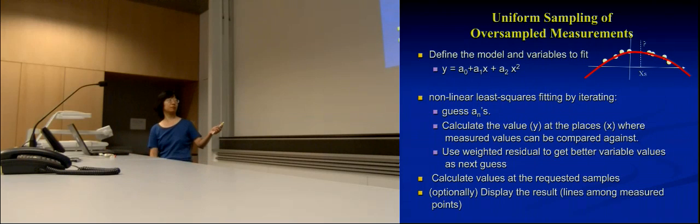The last one is, as I tried to go a little too fast over, the display. And oftentimes you want to display to the human being what the result is. Okay? So that's the 4 things that you do.